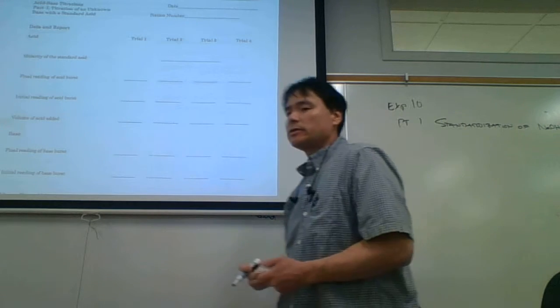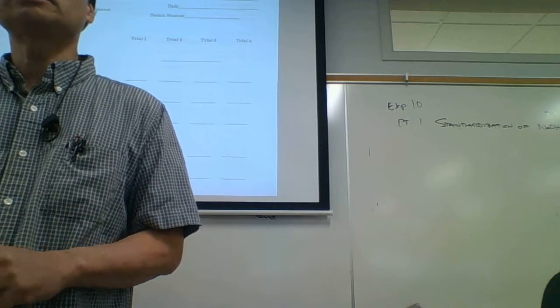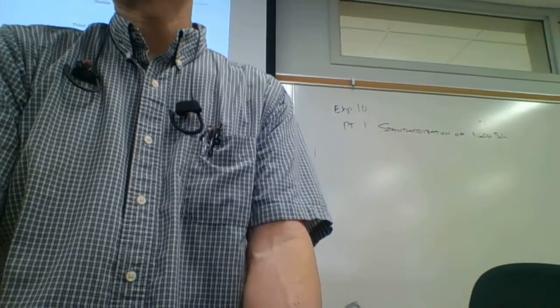So we did standardization of a sodium hydroxide solution, and somebody remind me, what is standardization? What does that mean, standardization?